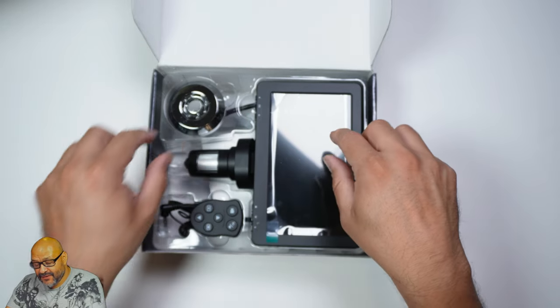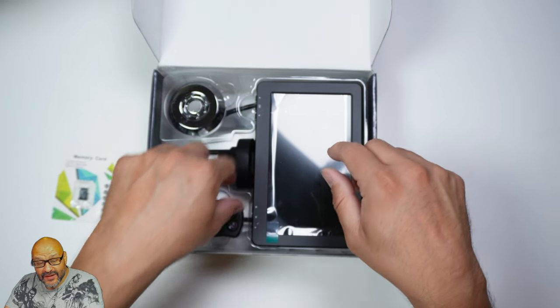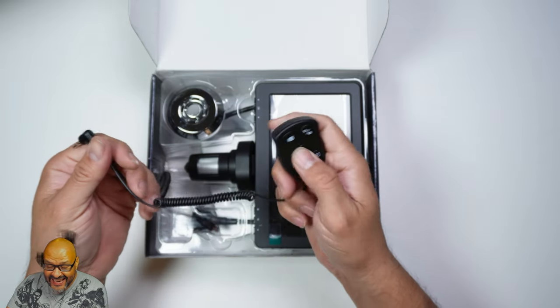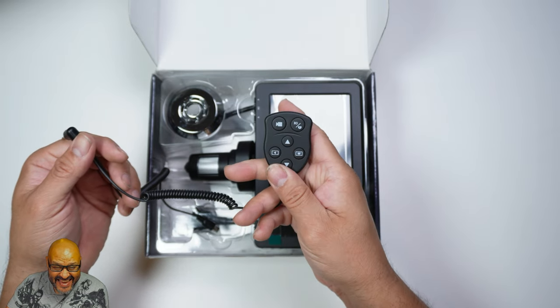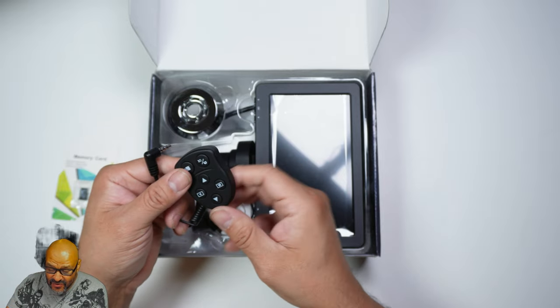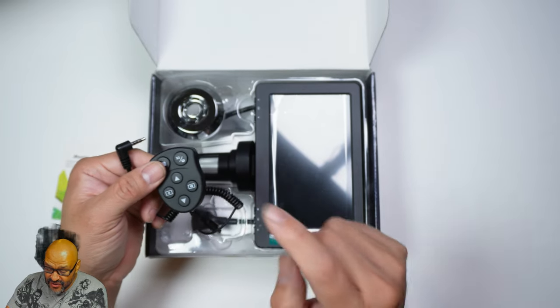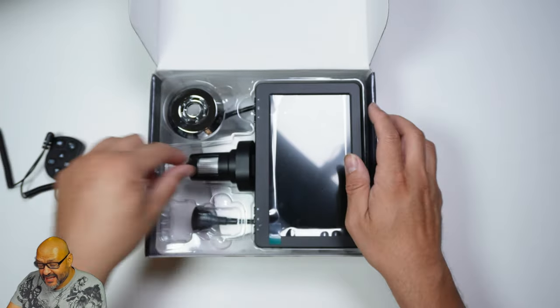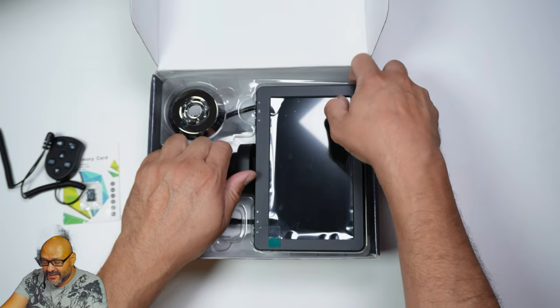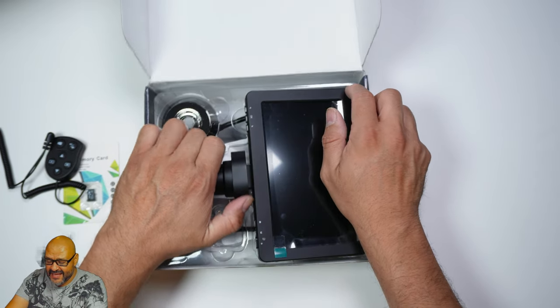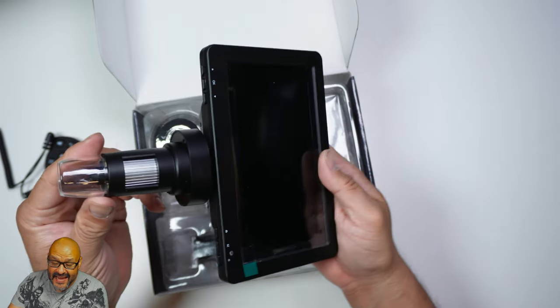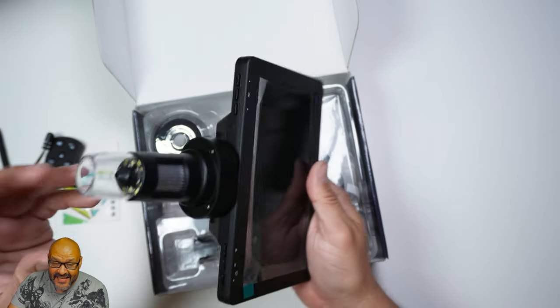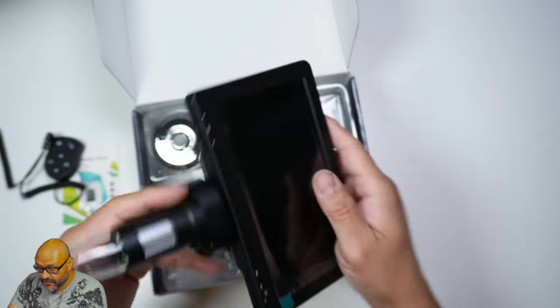They give you the whole system itself with a remote control that you can remote into it, click on it and record and play. You can do that through it. We're going to take a look at how beautiful this device is. It's all nice in there. It's heavy duty and they give you extra lenses and it has LED lights underneath. Let's put it together.